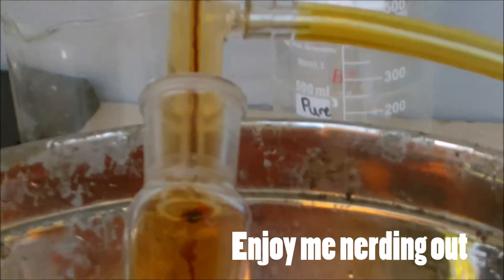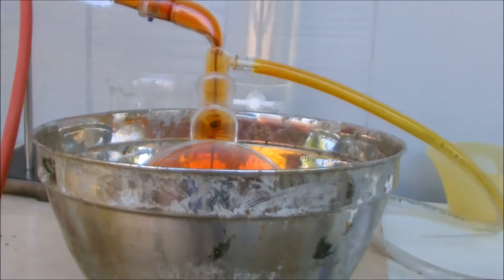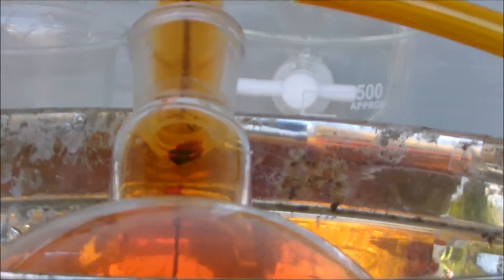Look at this steady stream of distillate. I haven't had this in my whole life. Guys, look at this. It's beautiful. I did it, guys.